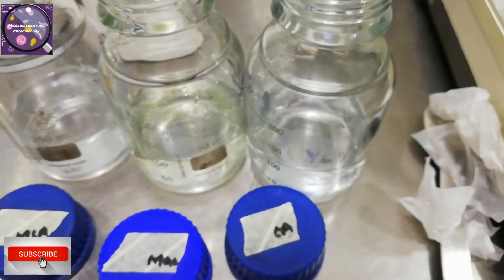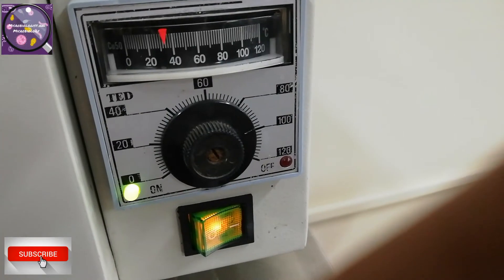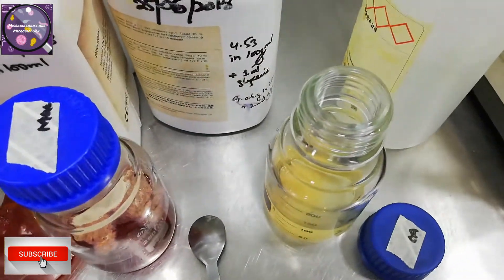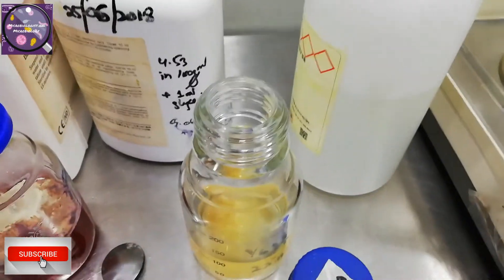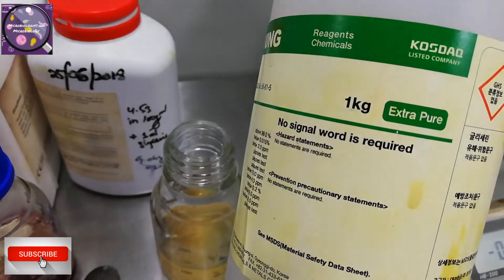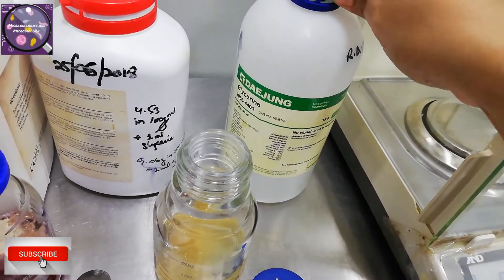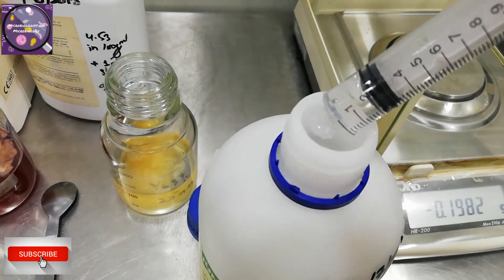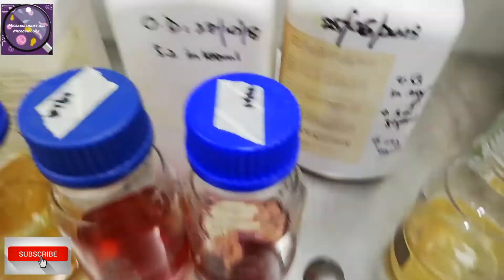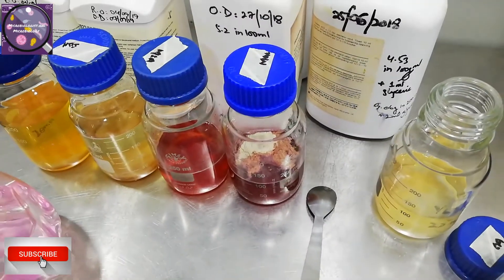In between I have turned on the water bath and by the time my work is done it will reach the selected 100 degrees centigrade. All the media have been weighed and I will add 1ml glycerin now to the cetrimide agar as per the description. This is my reagent bottle, glycerin and glycerol are the same, don't be confused between them. Now I am measuring 1ml through sterile syringe and adding 1ml to the cetrimide agar.